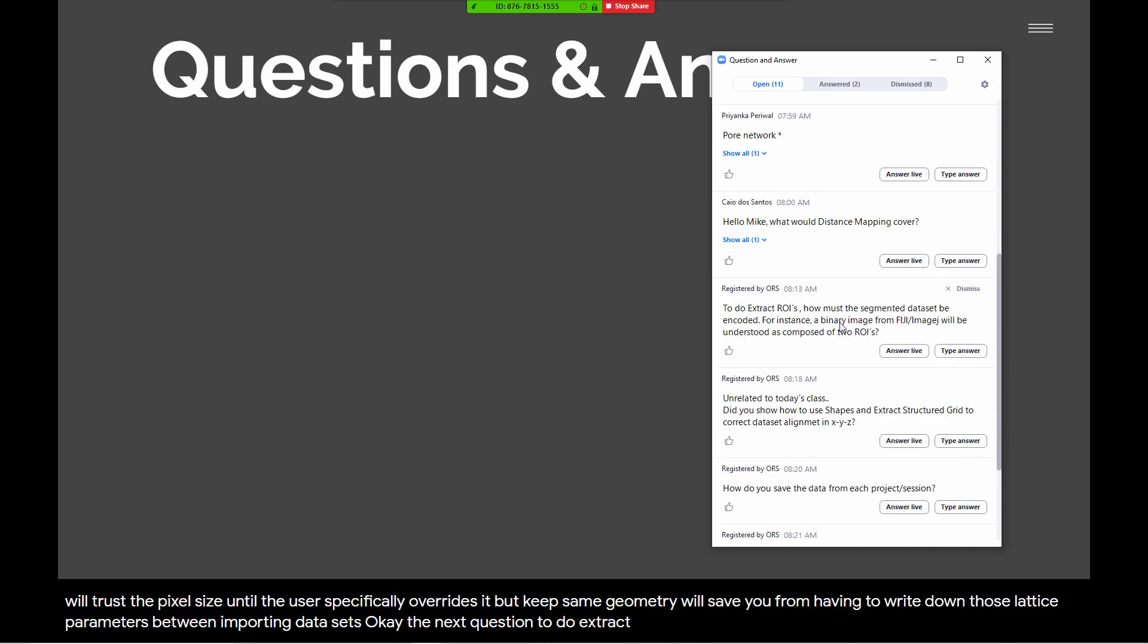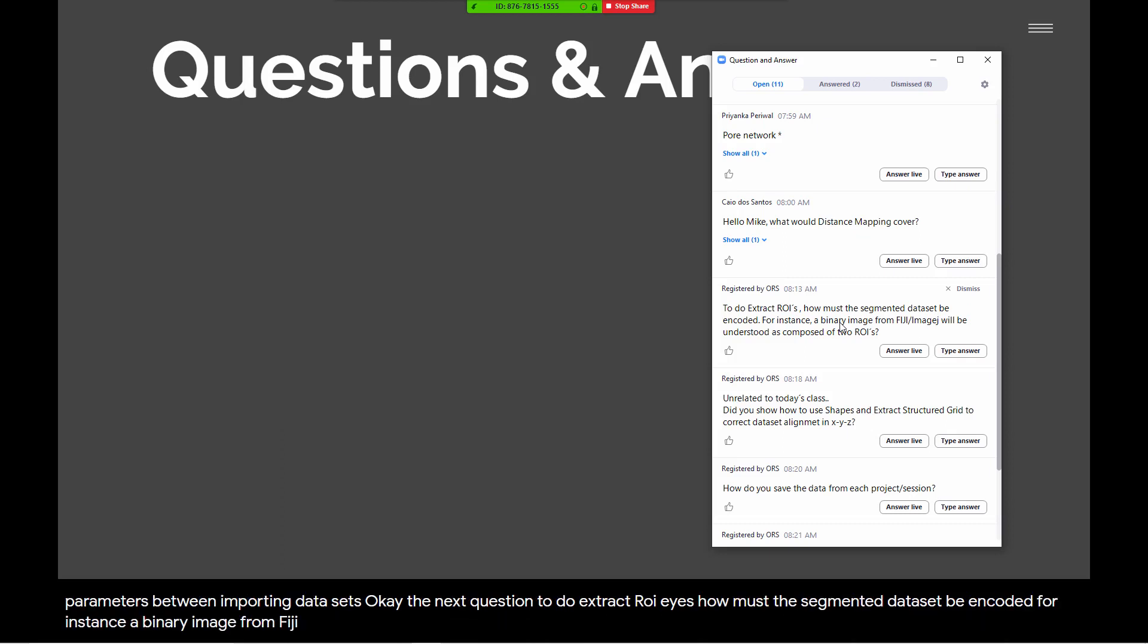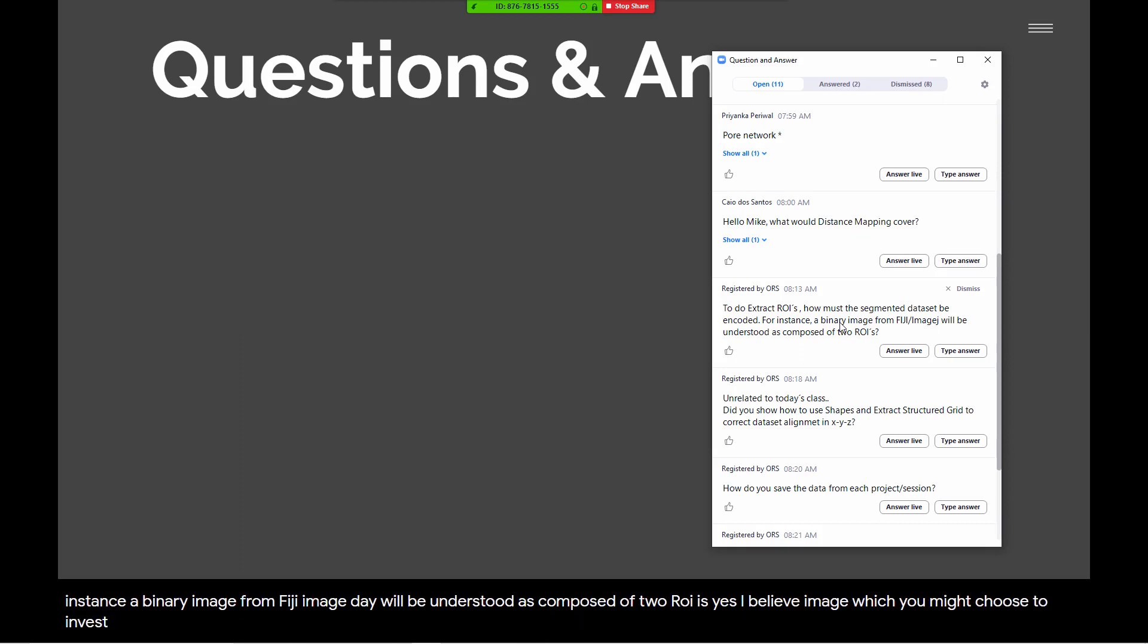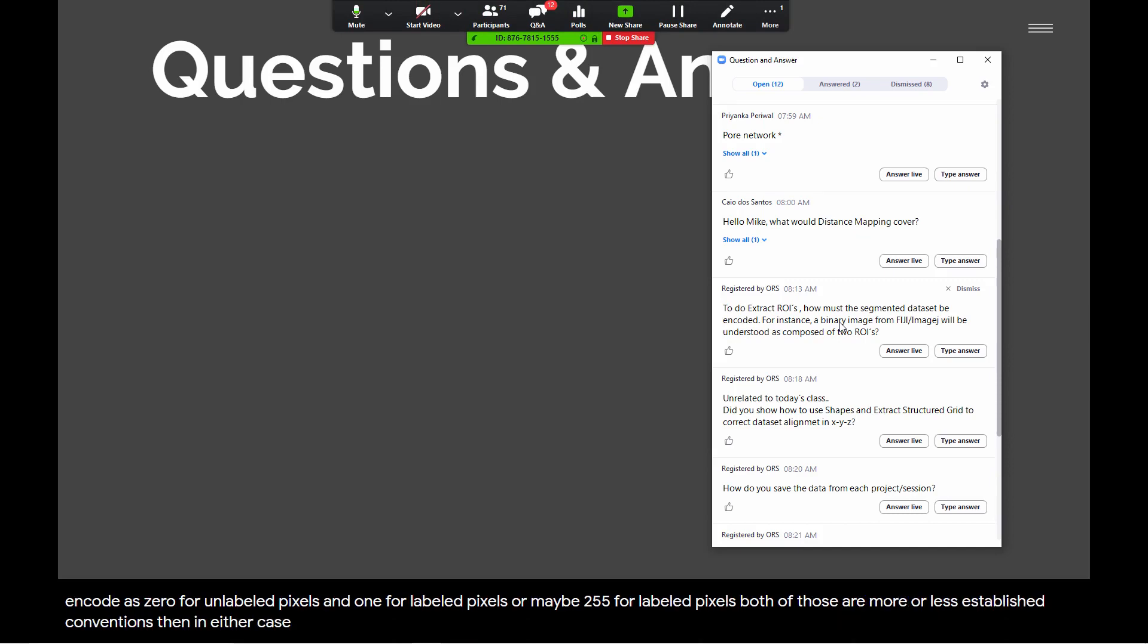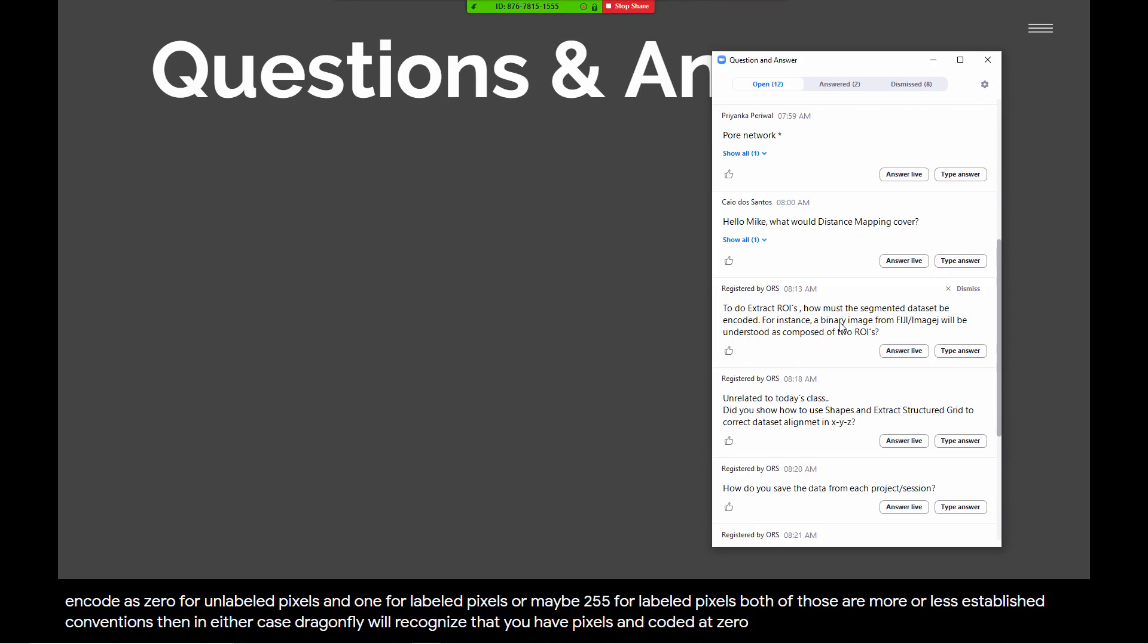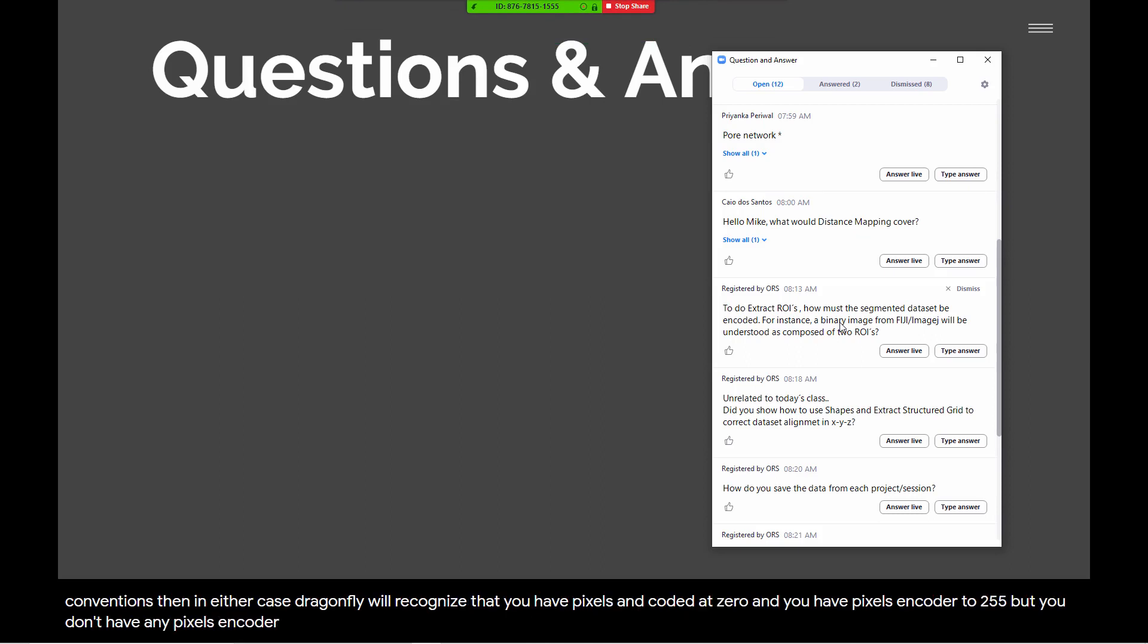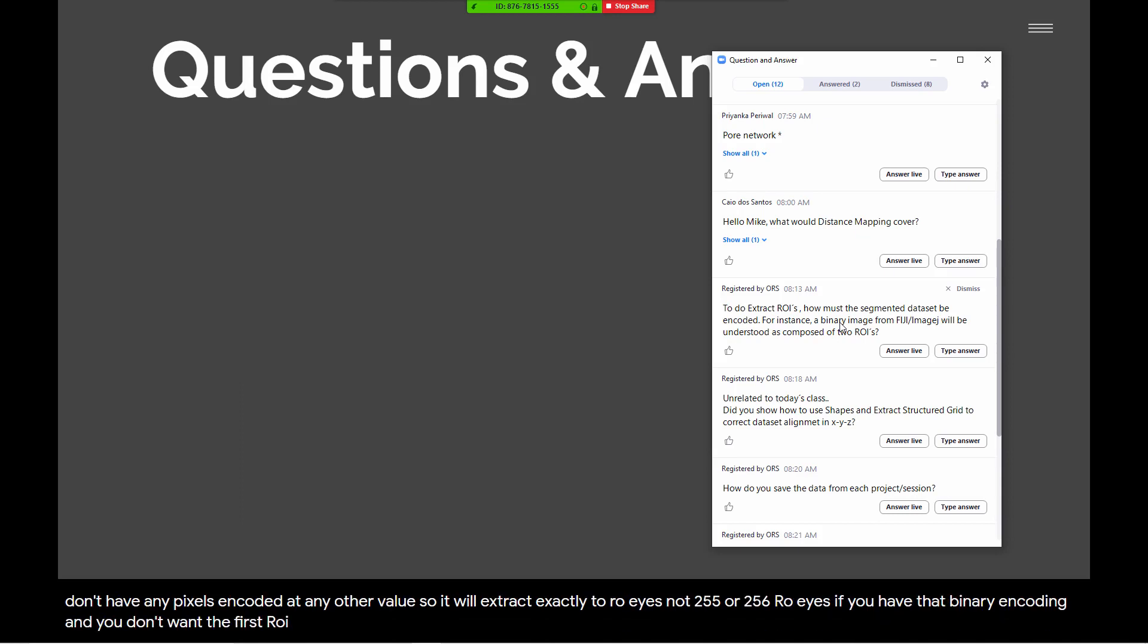Next question. To do extract ROIs, how must the segmented data set be encoded? For instance, a binary image from Fiji/ImageJ will be understood as composed of two ROIs. Yes, I believe that's right. I think if you have a binary image, which you might choose to encode as 0 for unlabeled pixels and 1 for labeled pixels, or maybe 255 for labeled pixels, both of those are more or less established conventions. Then in either case, Dragonfly will recognize that you have pixels encoded at 0, and you have pixels encoded at 255, but you don't have any pixels encoded at any other value. So it will extract exactly two ROIs, not 255 or 256 ROIs. If you have that binary encoding and you don't want the first ROI that is all the unlabeled pixels, then you would just delete it and save only the binary encoding of the foreground.